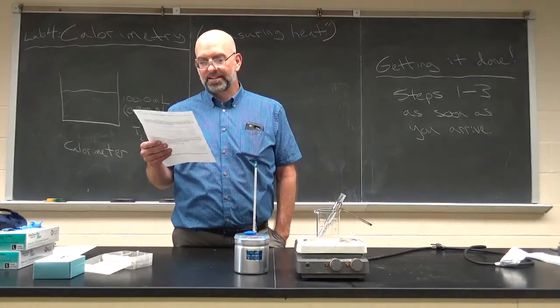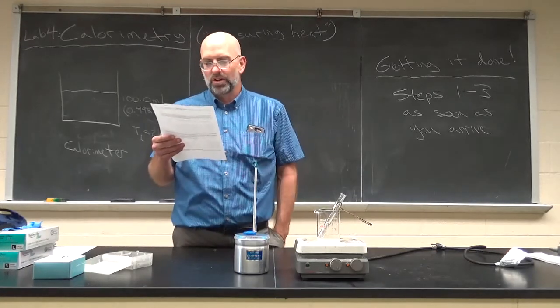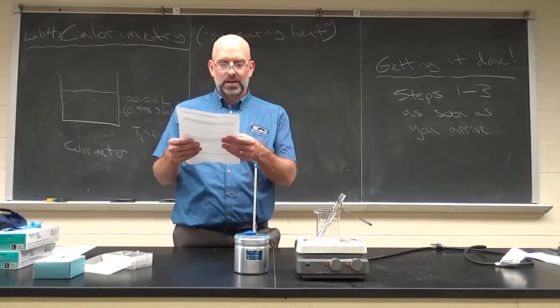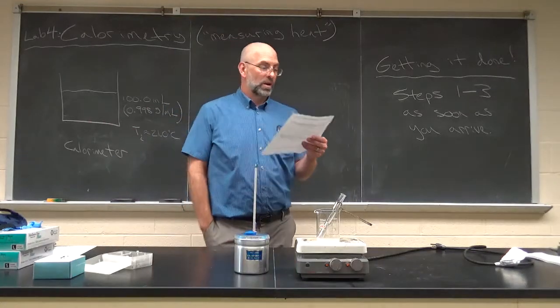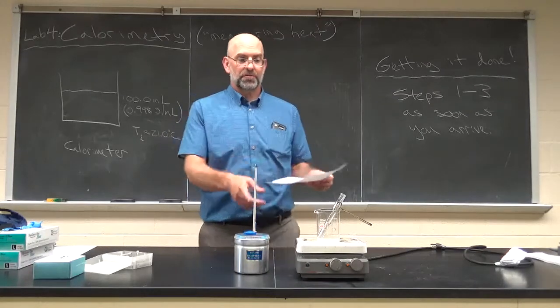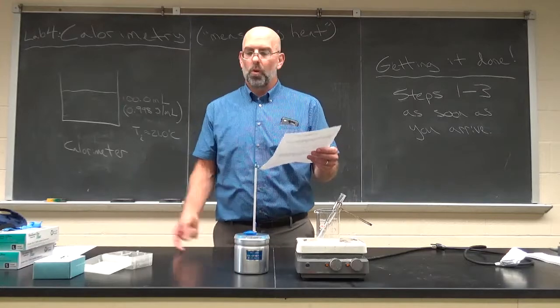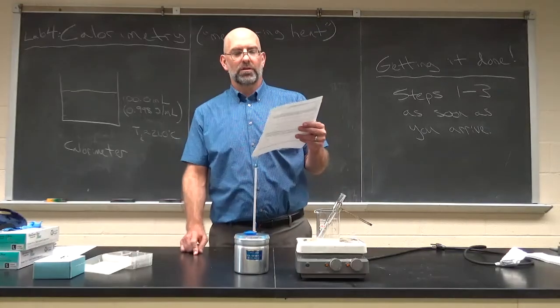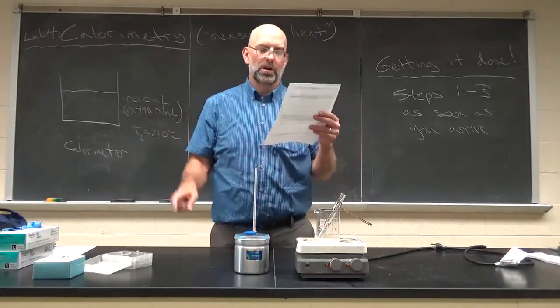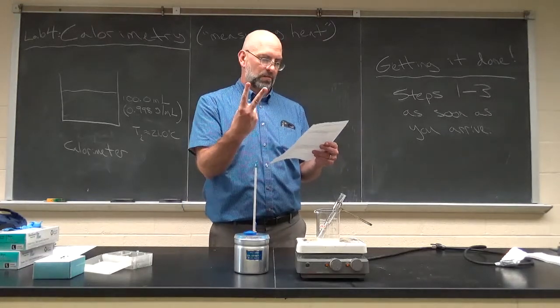Yeah, and then it says place the cups in a 250 ml beaker for more support. You don't necessarily have to do that. Okay, here's what I want to go through. Again, that is really all of the procedure. So you're going to do this procedure once with 100 milliliters of water in here, once with 85 milliliters of water in here, and once with 75 milliliters of water in here. If time is tight, we'll only do 2 trials.